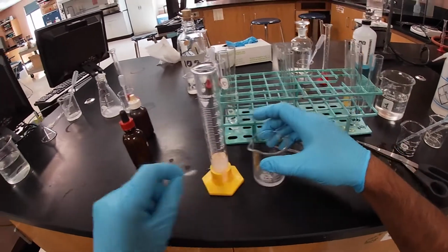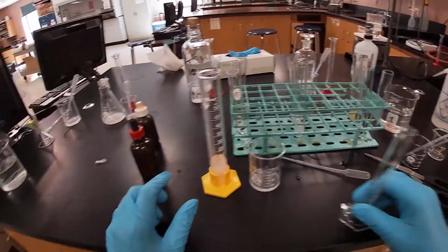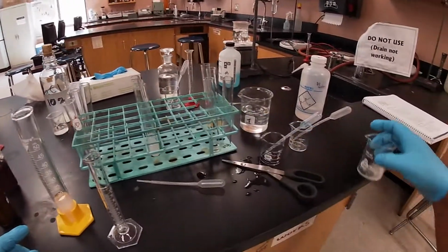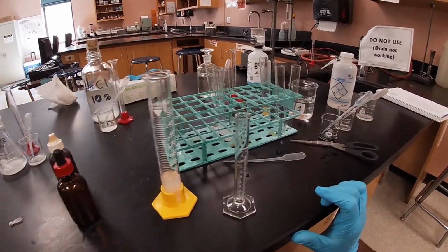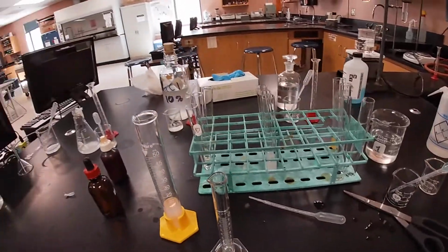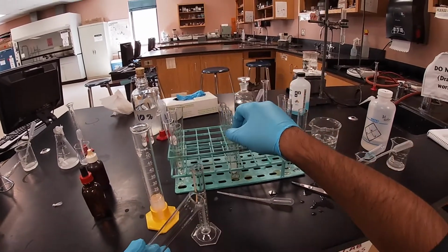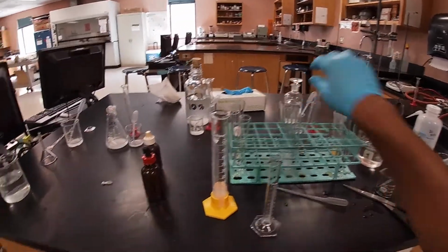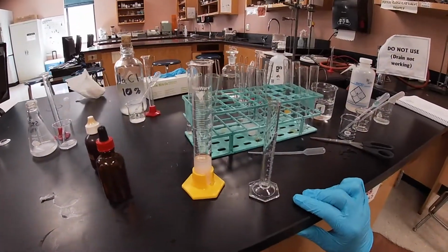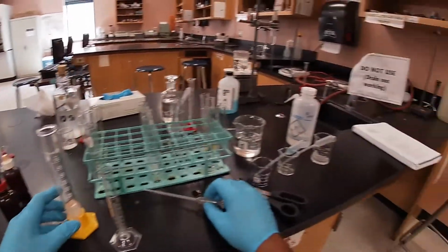All right, so then the next thing we're gonna do is get 3 beakers, and measure out of our 3 beakers. We're gonna run it through the filter. We're gonna get 3 test tubes again, and based on those 3 test tubes, we're gonna do the same test on the inside contents, right? So 3 test tubes again. Whoops, not that one, that one's dirty. Let's go ahead and put this over here in our dirty container. Dirty spot. We got another test tube. This one's good.